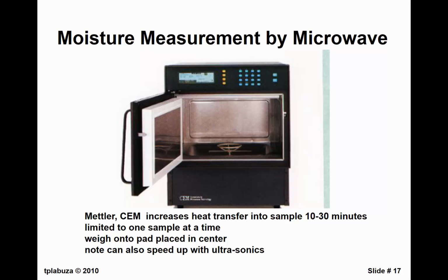Okay. And what else? Karl Fischer and vacuum, okay. So I got one more to talk about that you do, Karl Fischer. And there are some new ones that have both microwaves and also some ultrasonics in them. That makes it even faster.